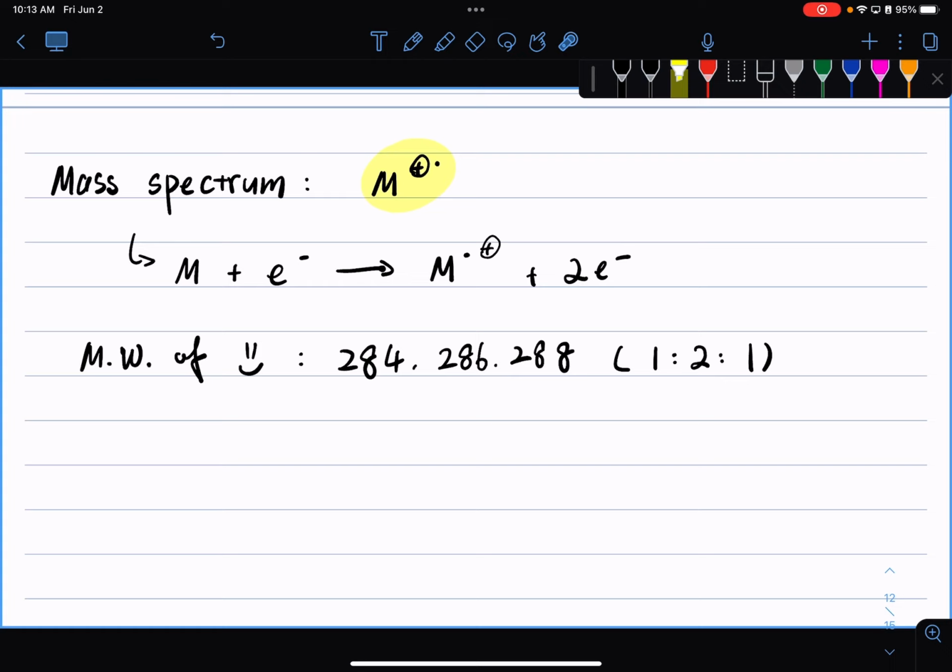So, but nevertheless, what we're proposing here is we're having a mixture. So we have 2 different isotopes. We have 2 halogens in this molecule. Now, whether it's chlorine or bromine, that depends on the ratio here. So your chlorine has a 1:3 ratio. Your bromine has a 1:1 ratio. So let's just say you have 1 bromine and 1 chlorine, and let's see what that looks like.